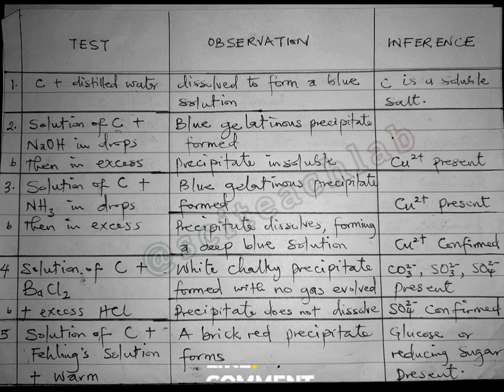So if in your own case they look for copper ions, but they don't want you to find sulfate ions, then fine. And then they want you to test for glucose, and that's fine. That means you'll be looking for Cu2+ and then test for sugar. But then I may also be given to find SO4 2- and Cu2+ and no test for glucose. Or you may be asked to find all of them, or whatever it is, I've got you covered.